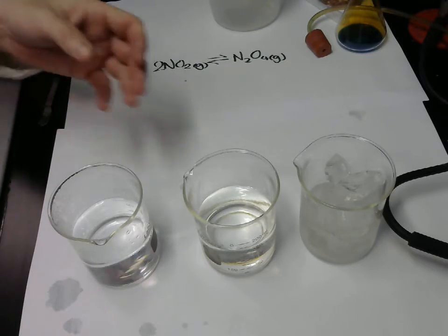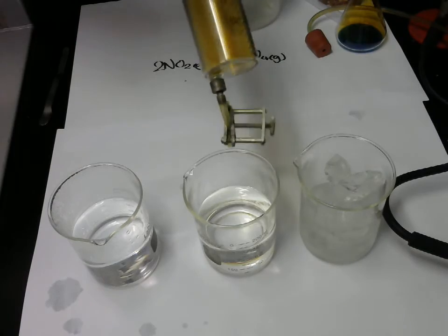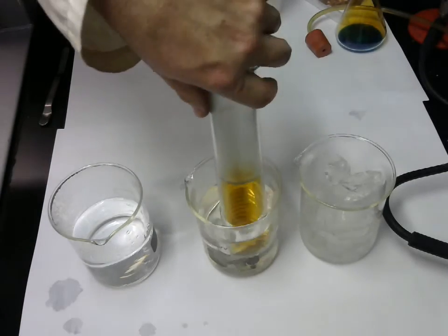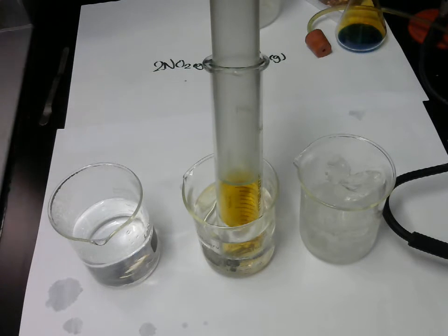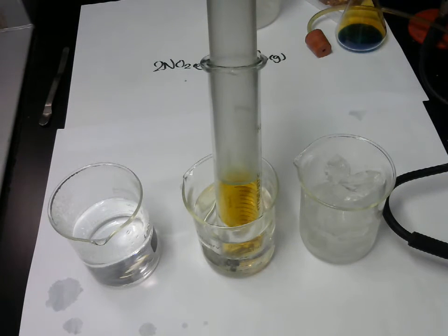And I'm going to put it into different temperatures. So I'm going to start by putting it in tap water because that can be my benchmark, that's my control. So I'm just going to let it work out a colour it's going to go, and pressure. Okay, it's pretty good, that's probably enough. Would you like me to put it in iced water or hot water first? Hot. Yep, you guys all good with that?